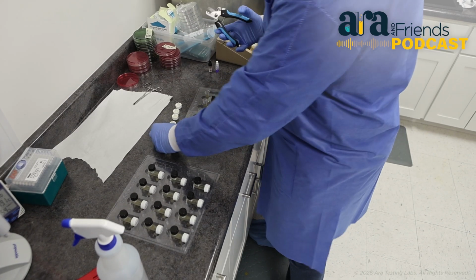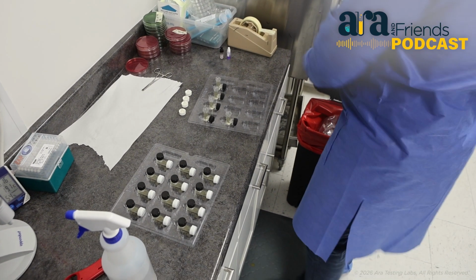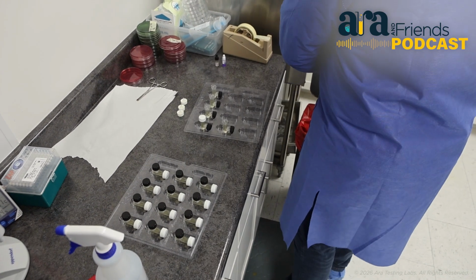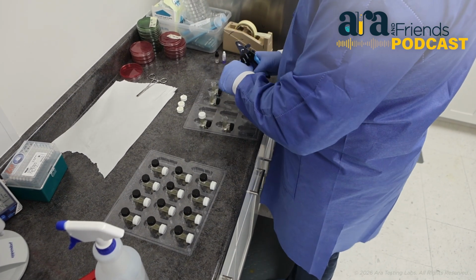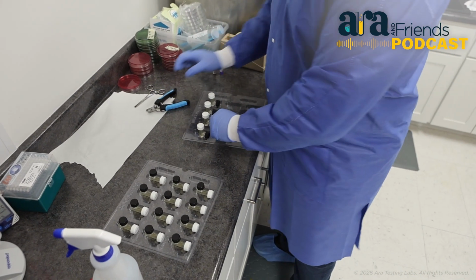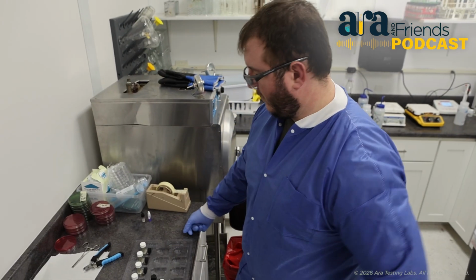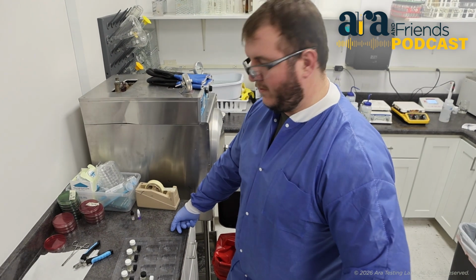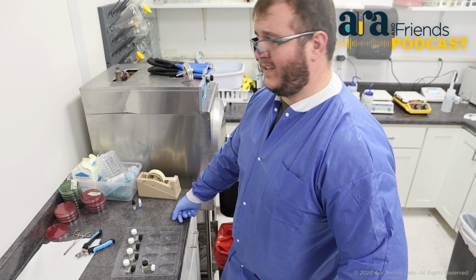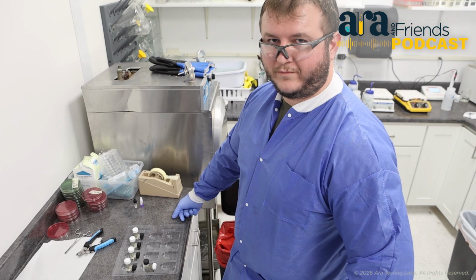Take our fancy clippers and clip off this tip portion of the cap. Okay. Now these tests are ready to go. Then you will inoculate them with 100 microliters of your sample into the black cap side, and then incubate them 16 to 24 hours in a 37-degree incubator.